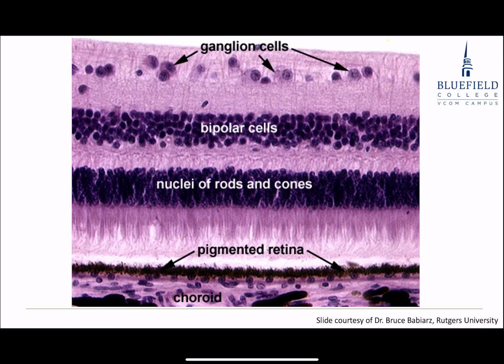All right, we look at the retina. Top of the screen here would be my vitreous cavity. And so these are this first layer of nuclei. There shouldn't be as many of them. It should be the fewest number, and within this layer, those would be my ganglion cells. What's this layer up here between the ganglion cell nuclei and the vitreous body? That's where their axons are coming up and then going left or right to go to the optic disc and leave the eye to the optic nerve.